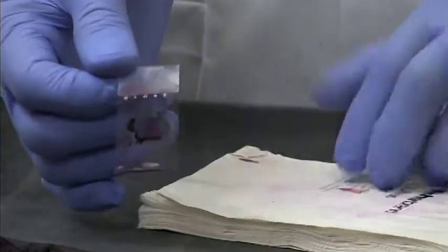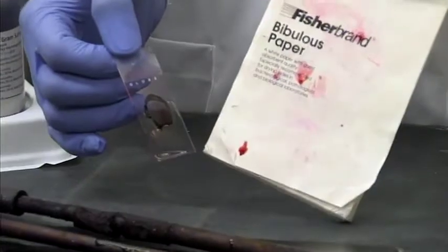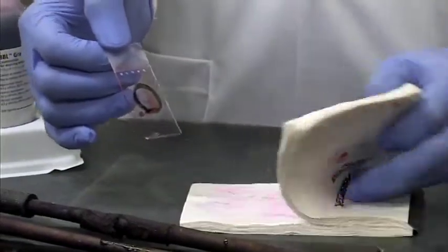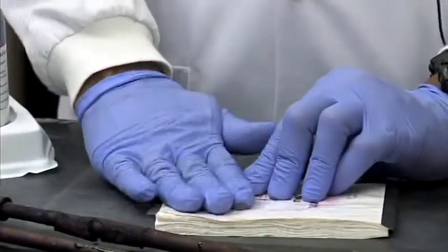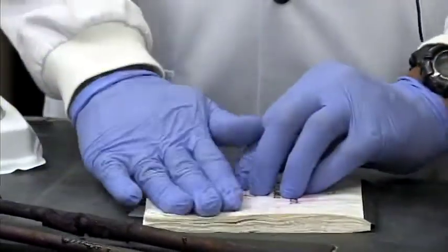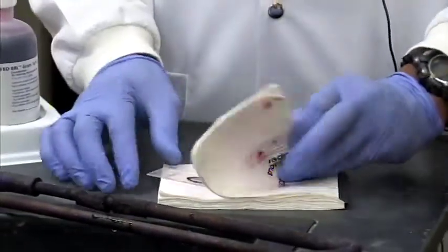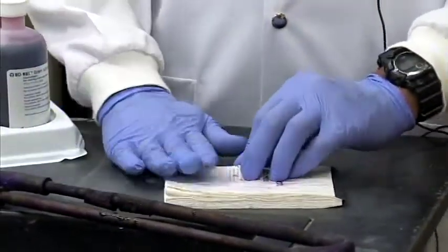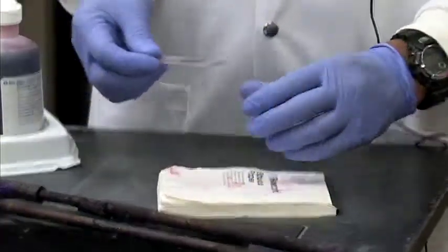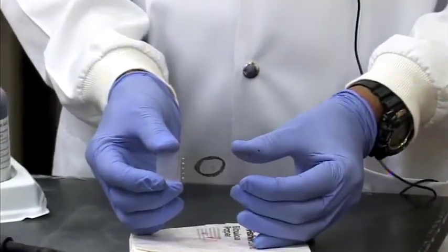We have to dry these slides now. Either you can leave it upright and let it air dry, or we can use bibulous paper, which is blotting paper, and simply place your slide within the booklet, press it gently, not too hard to break the slide, remove it, apply it to a different page, press again. Do this about 3 or 4 times until your slide is completely dried. When your slide is completely dried, hopefully you will see no water droplets or no moisture on the slide.